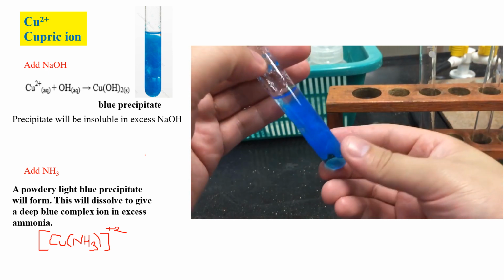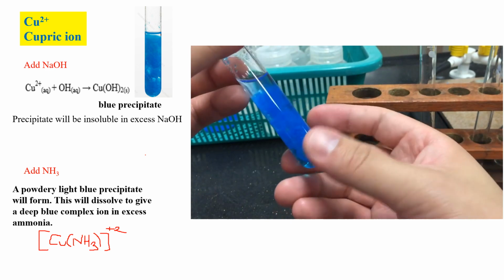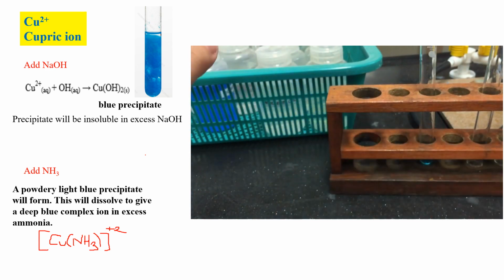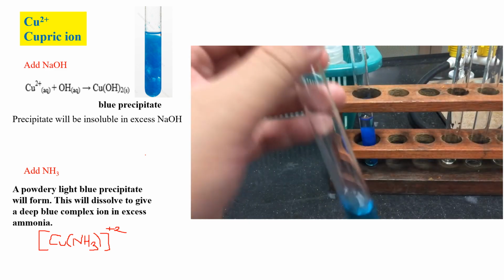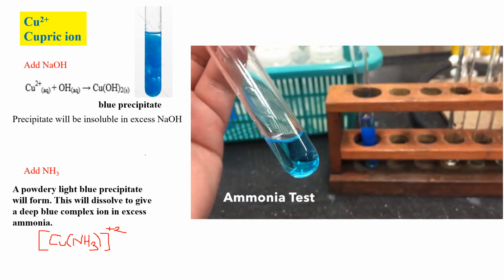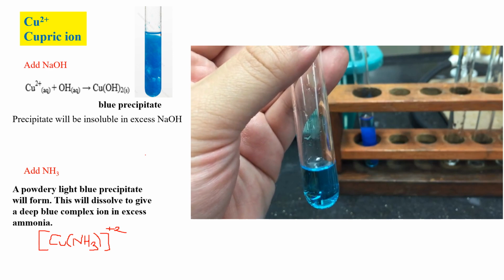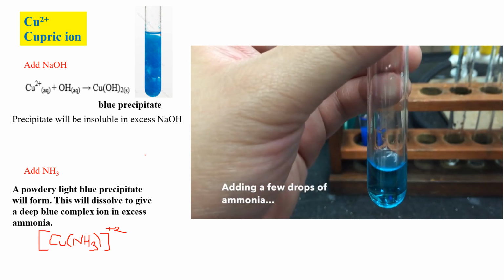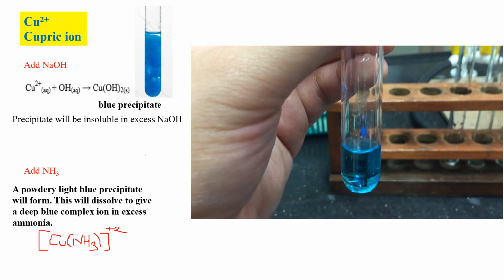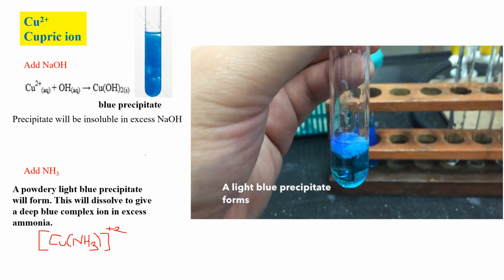Another test you can use is the ammonia test. To a small sample of the solution, add a few drops of ammonia solution. You will notice a light blue precipitate forms immediately.